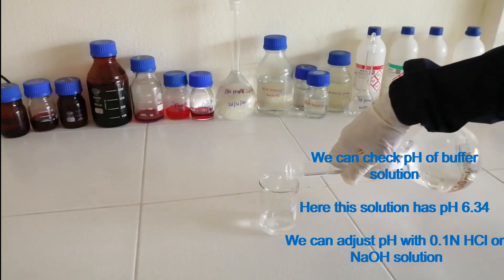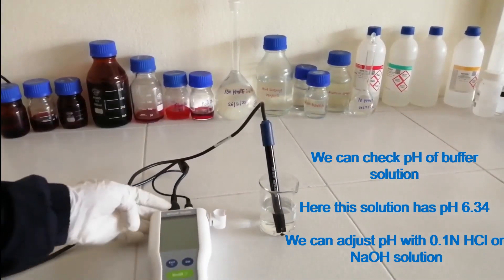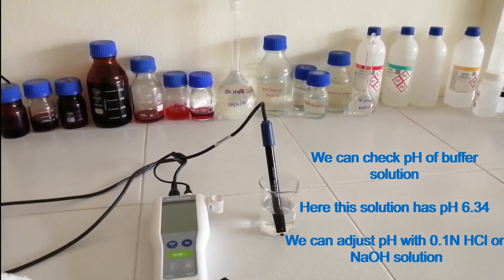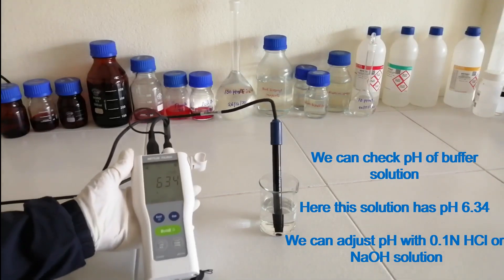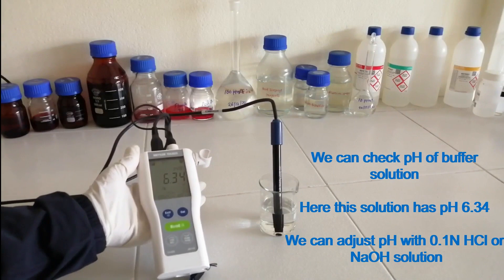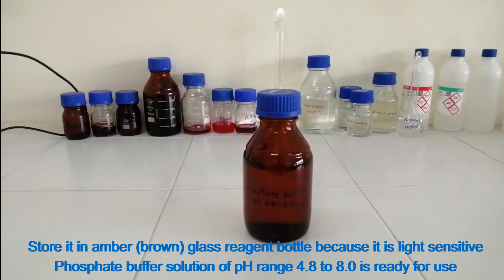We can check the pH of the buffer solution. This solution has a pH of 6.34. We can adjust the pH with 0.1N hydrochloric acid or sodium hydroxide solution. Store it in an amber glass reagent bottle because it is light sensitive. The phosphate buffer solution of pH range 4.8 to 8.0 is ready for use.